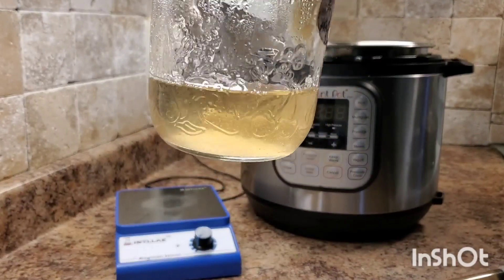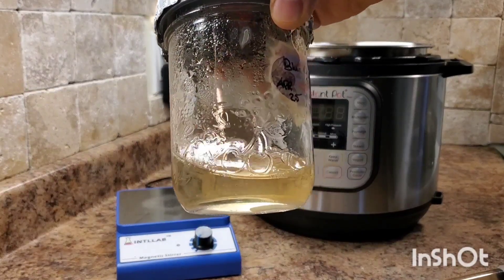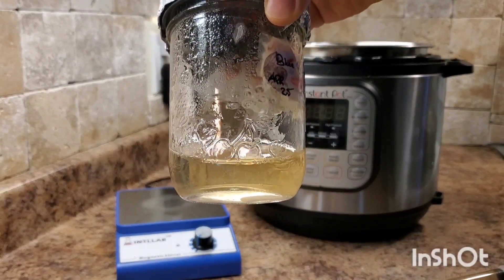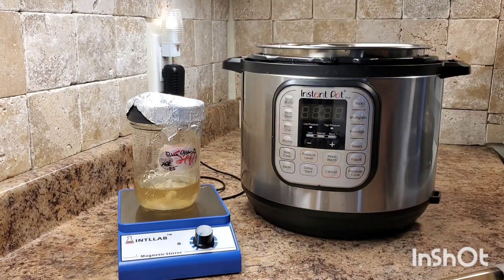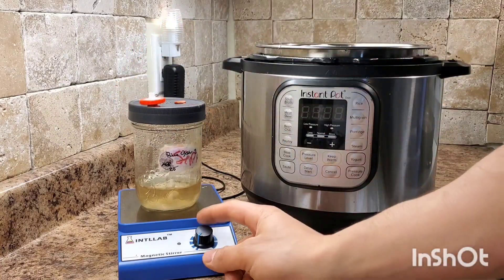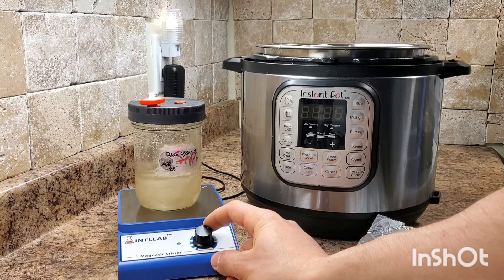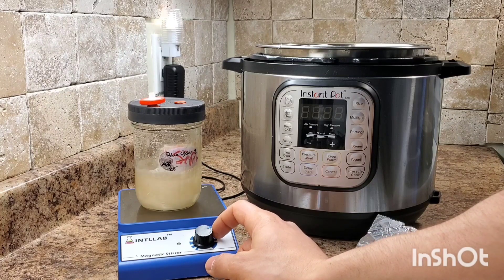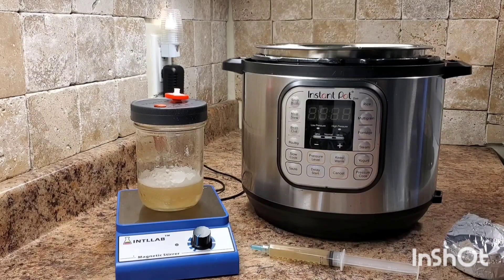I've put a magnetic stir bar in here which is going to make things a lot easier, but you could easily replace that with some broken glass, marbles, or probably a number of different things. Before we inoculate our liquid culture we need to oxygenate it, so we're going to blend everything together and oxygenate the liquid. After that minute, you'll be ready to inoculate with liquid culture or agar.